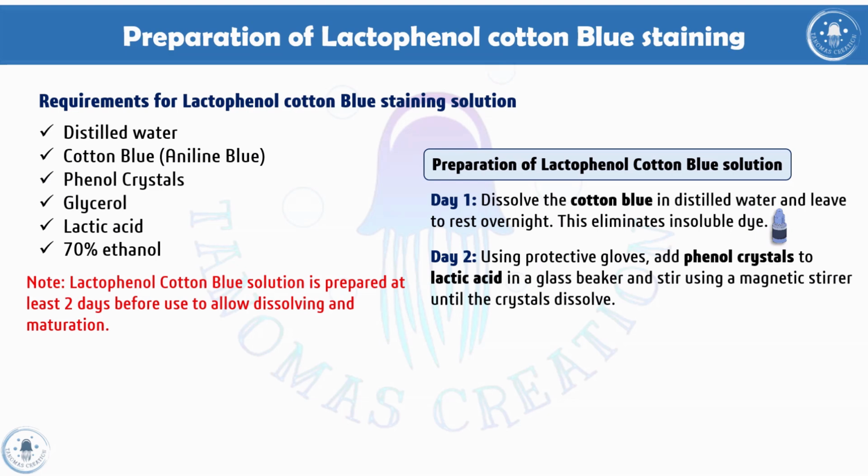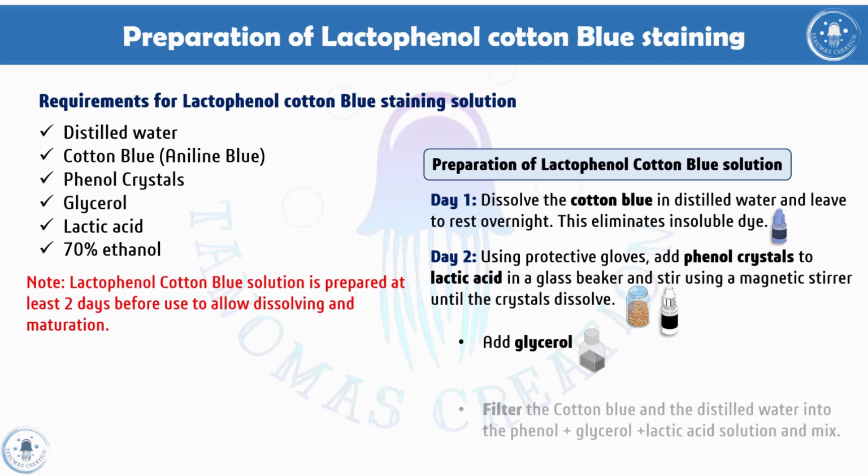Now after adding these crystals to the lactic acid, you stir it using a magnetic stirrer until the crystals dissolve completely. You have to keep on mixing until it is properly mixed. After that, you add glycerol to it. You need to add the proper amount of glycerol.